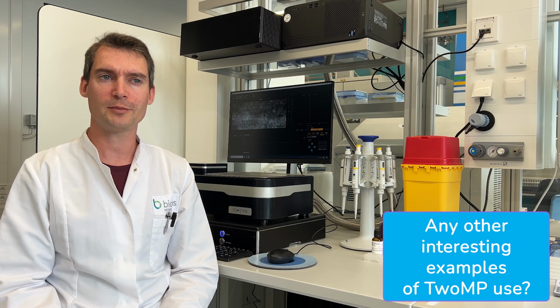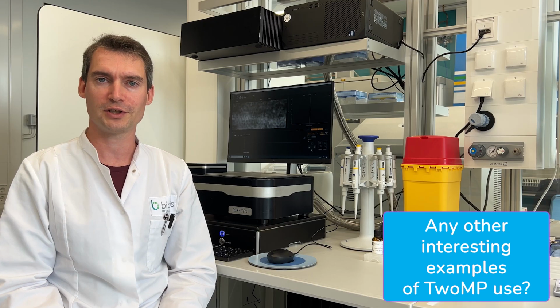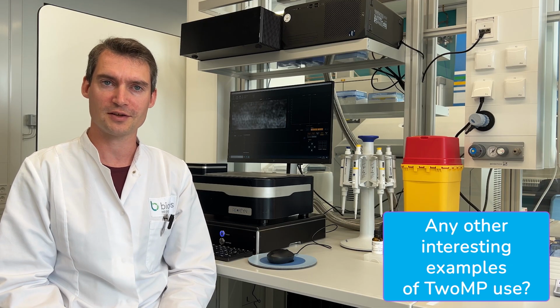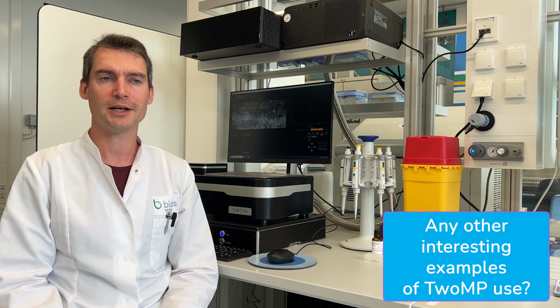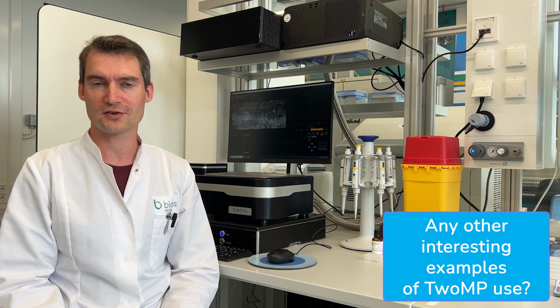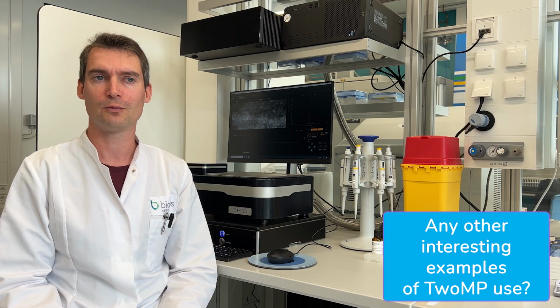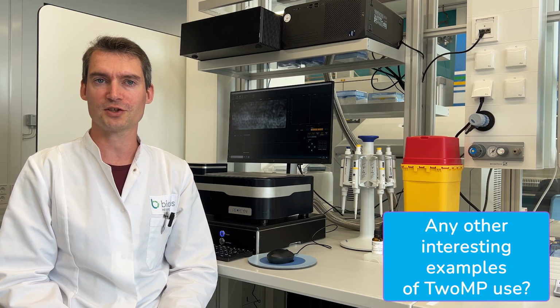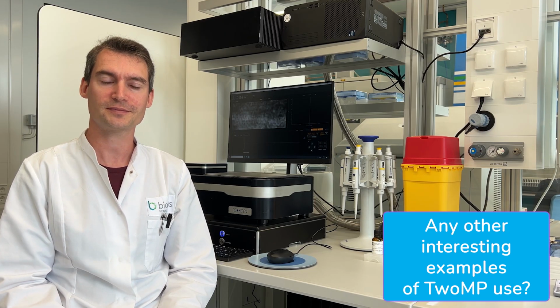So normally, if you have very small crystals, you don't have enough material to look at them properly in an SDS page, especially if you want to see a small fragment. And in this case, I could take the tiniest crystal, dissolve it, put it back into the mass photometer and prove that while we are missing something of the structure, the protein in the crystal is fully intact. So that is really nice to find out.